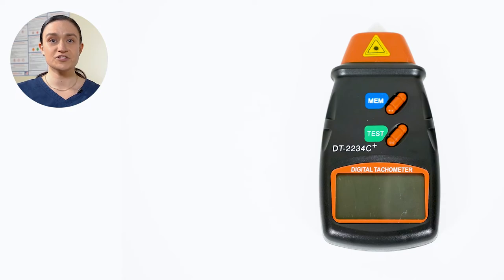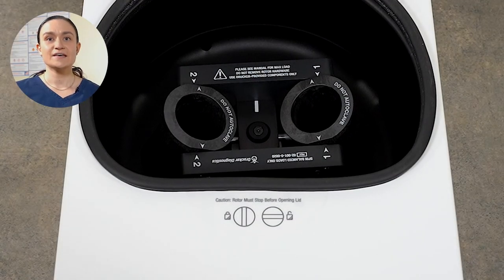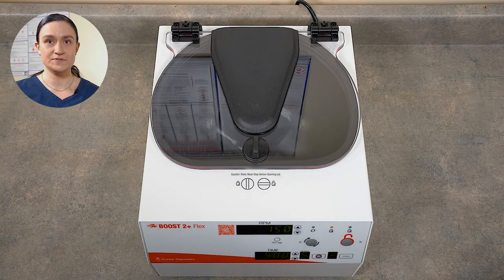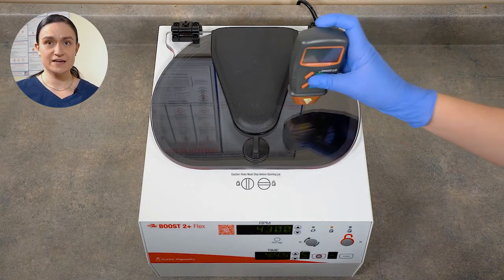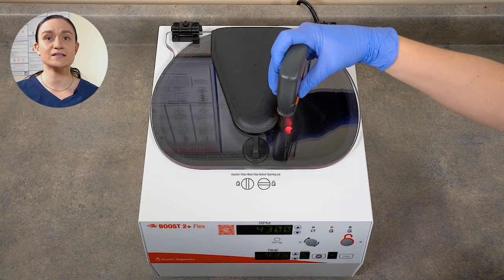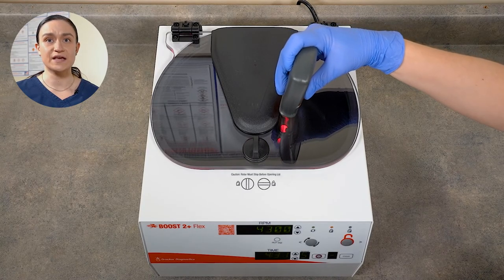Your Boost 2 Plus Flex does not require any regular maintenance, but you may wish to confirm your spin speed. To do that, you will need a photo tachometer — we are showing one here for reference. Your lab should have a calibrated photo tachometer available for this purpose. The rotor of your Boost 2 Plus Flex has a photo strip on it already, so no need to add one before using your photo tachometer. Simply select the RPM you would like to evaluate, then press the Start button. Once the centrifuge reaches that RPM, the countdown timer will start. Use your photo tachometer and point it down through the lid, right up against the black part, making sure the tachometer is looking down through the clear lid. You should receive a reading almost immediately.